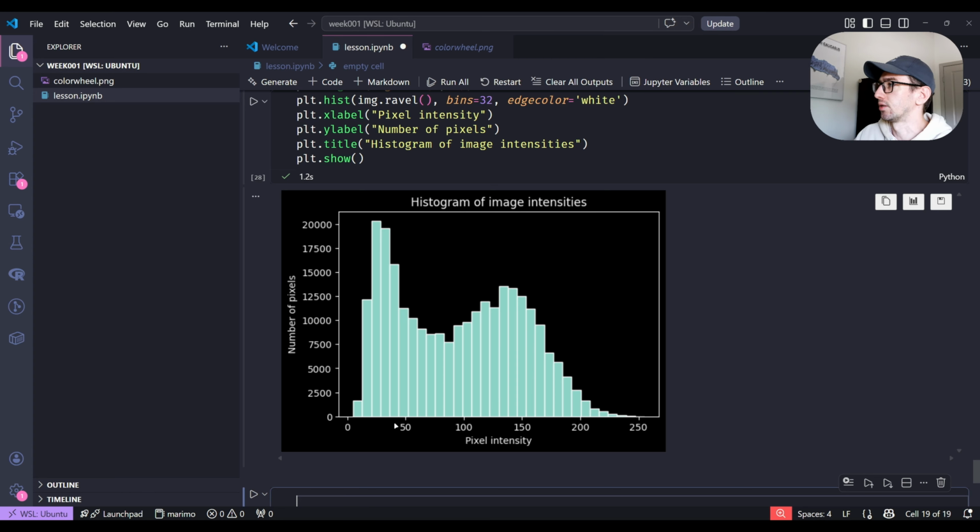So guys, are there some data scientists? There is low contrast in the picture. I mean, a lot of gray. The number of pixels in gray is very high. Okay. Maybe some other ideas? Multimodal distribution.